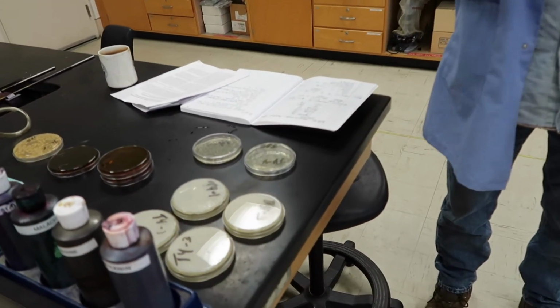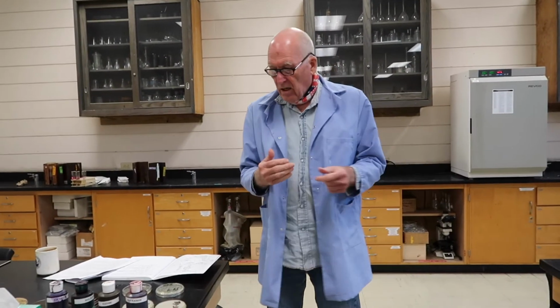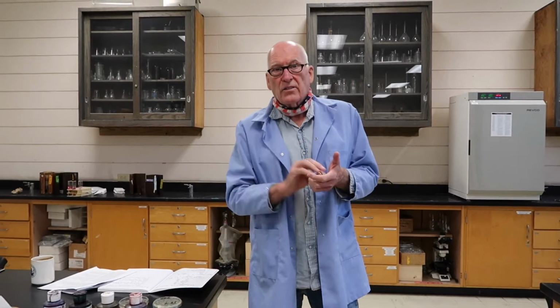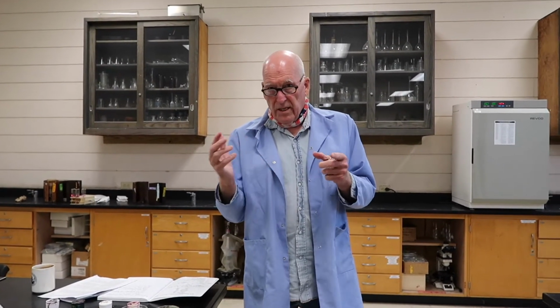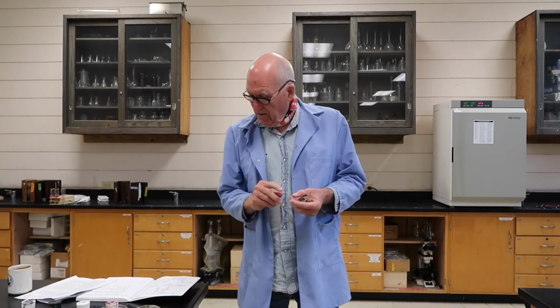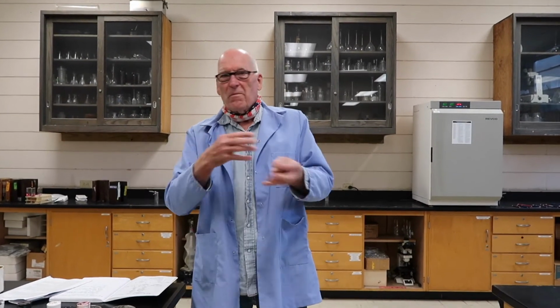Now, the other purpose of this video is, you have online from summer 2020 a video where we videotaped the sauerkraut project. And in that one, we showed you some numbers, but the difference is that in that one, we incubated the summer ones at 18 degrees. For some reason or another, we did these at 21 degrees. So the 2-day and the 4-day don't match up at all.